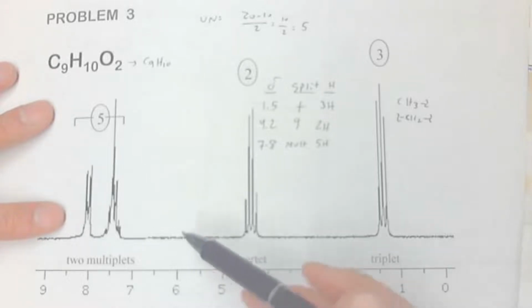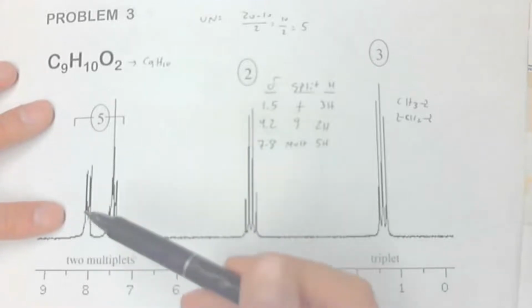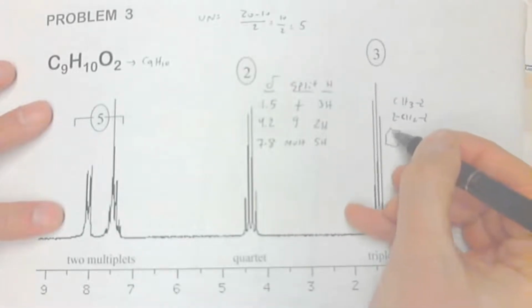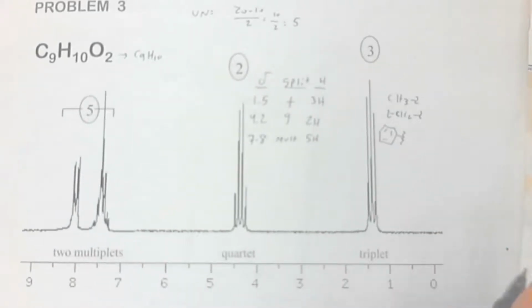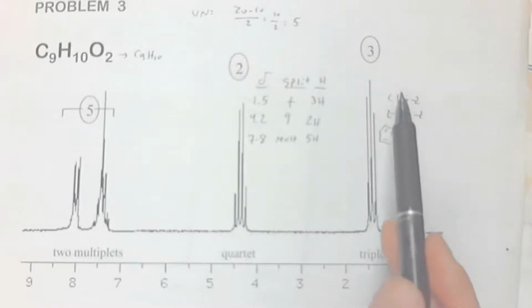It's totally mono, right? Because 5 hydrogens means 1 connection, right? 6 positions, 6 minus 5 is 1. So it's monosubstituted. We'll do disubstituted in a bit. Okay, are we done with that step of identifying the substructures?